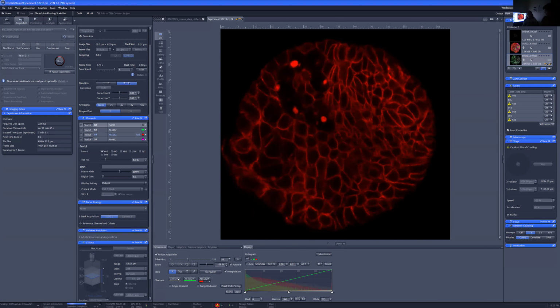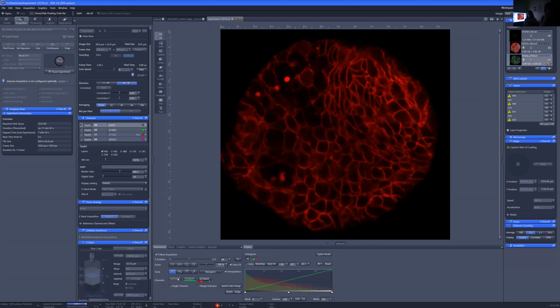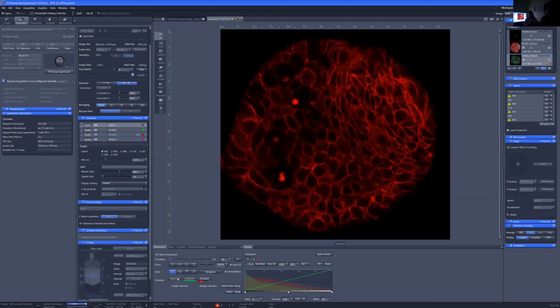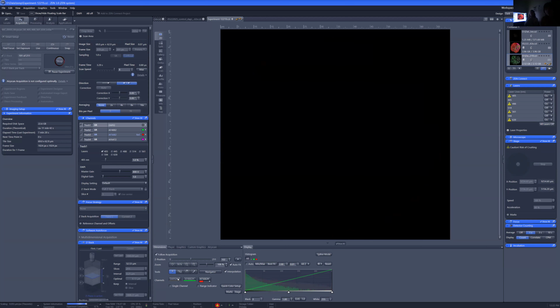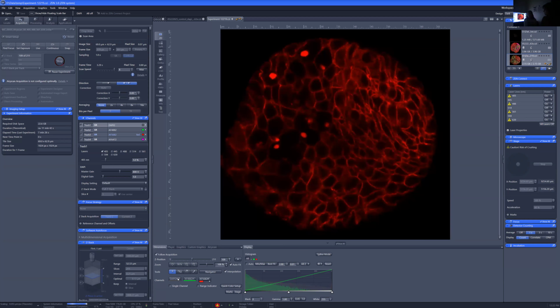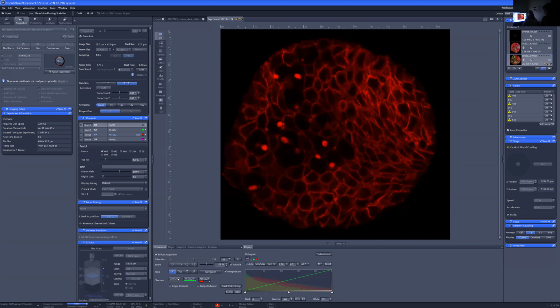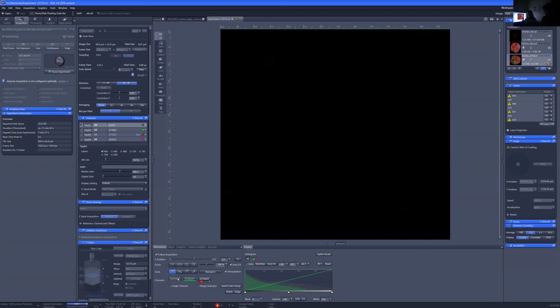But there are between 100 and 200 egg stem cells in every single ovary, and they are really overlapped on top of each other, so it's really hard to manually count. When I first started working on this project, I thought I was just going to have to sit down and look at every single frame of the image and count how many egg stem cells there were.